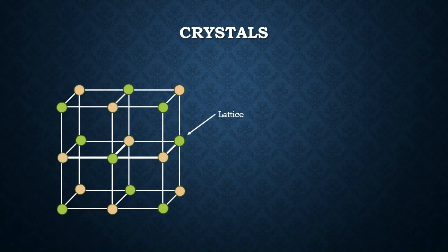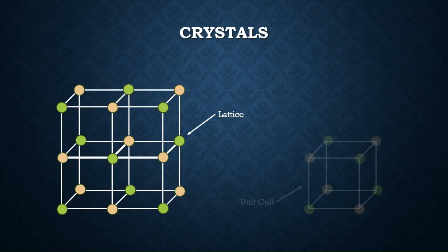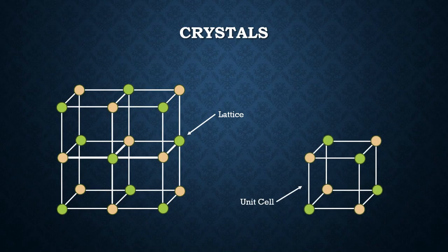First things first, it is important to know about crystals before discussing X-ray crystallography. A crystal is a naturally occurring structure formed from atoms that are ordered very specifically in the form of a lattice. They usually take the shape of a rectangular prism or cube. The total structure is made up of many unit cells, which is the formation the atoms take without repetition.